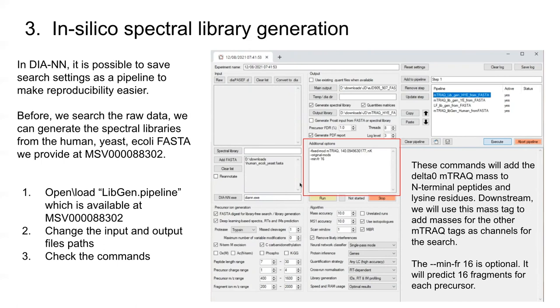We don't have to do that to get it to work. The other thing to make sure to do is make sure these boxes here are clicked. This is precursor ion generation. What this is going to do is read in the FASTA that you have, digest it based on whatever protease you select, and predict what are the spectra, the retention times, and the ion mobilities for each one of the precursors generated from your FASTA.